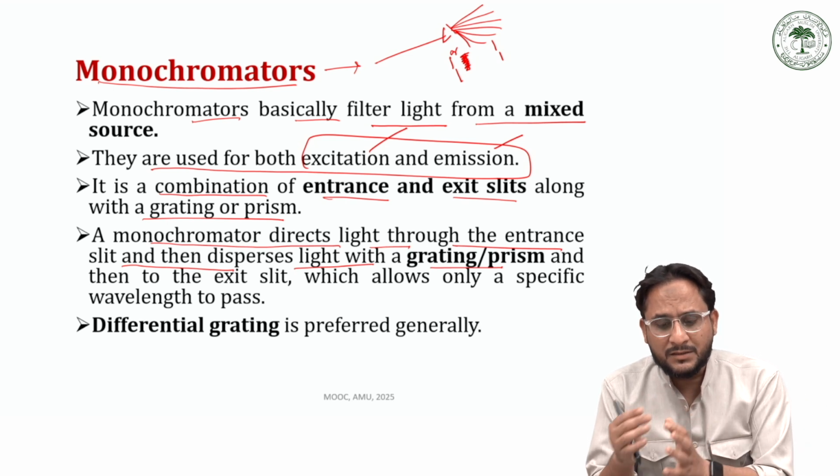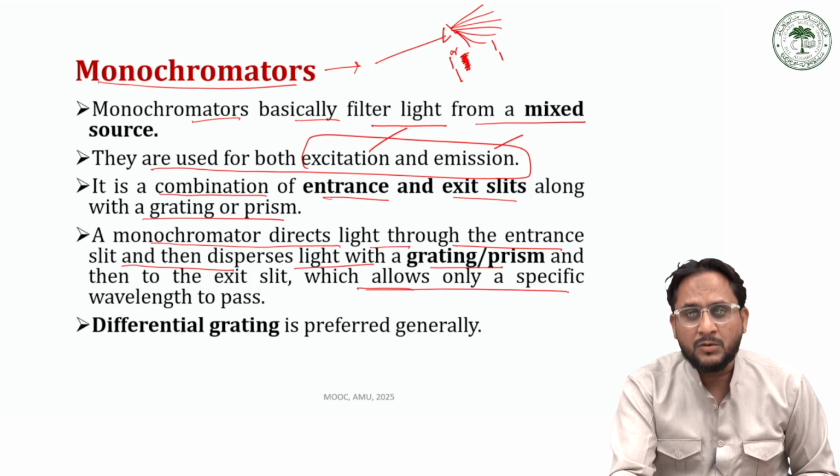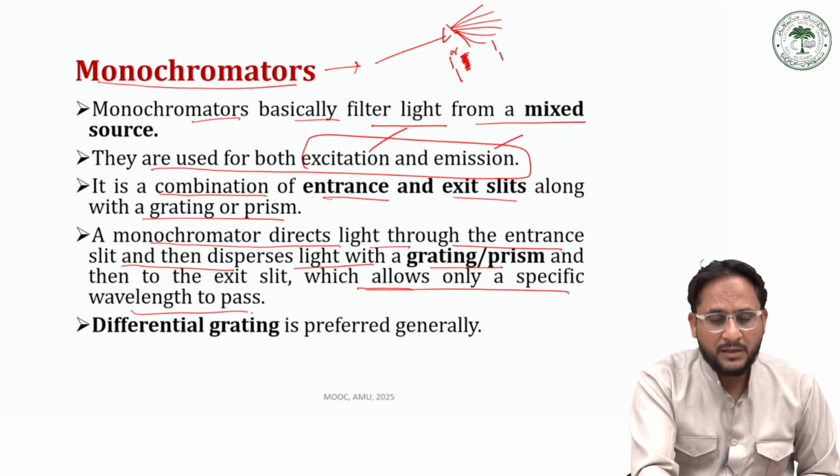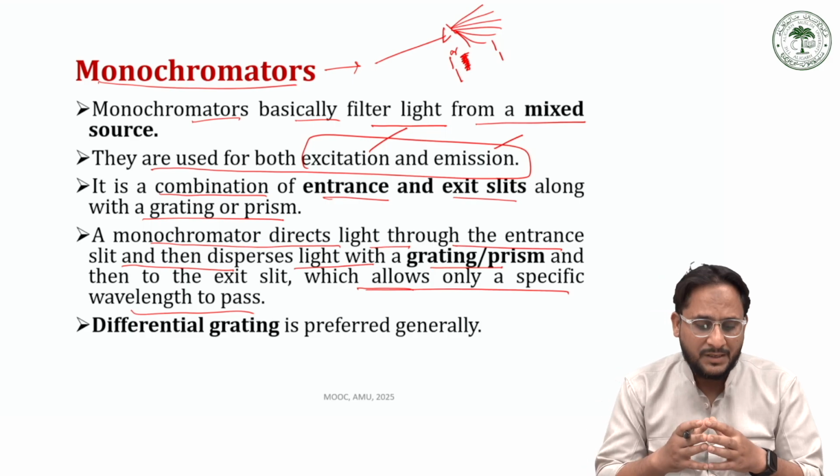In this way it acts as a filter, and those radiations allowed through the exit slit finally enter the sample tube and cause excitation.